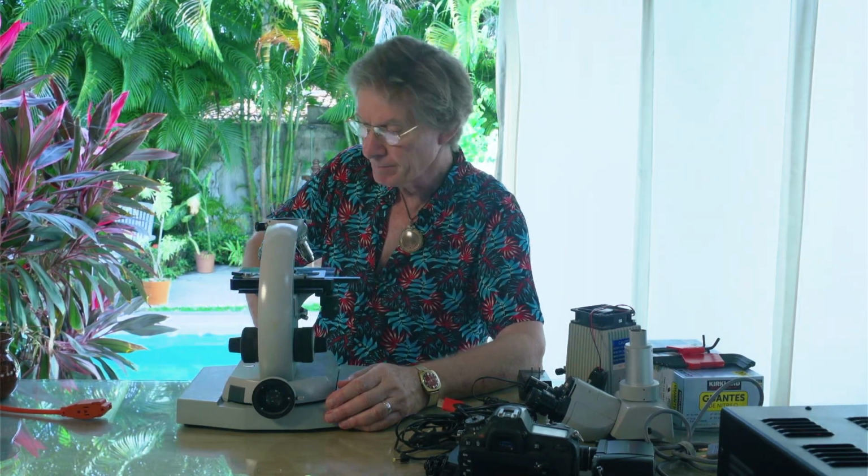So let's start by looking at a microscope. Microscopes have been around for hundreds of years. Physicians have been looking at blood under the microscope for a very long period of time. They started doing this over 100 years ago, and then all of a sudden, about 50 years ago, live blood analysis came into being, and it has now evolved into a very, very sophisticated, extremely sophisticated art and science, which we teach. So let's have a look at a microscope. A micro simply means small, and scope means we are looking at something extremely small that cannot be viewed with the naked eye.